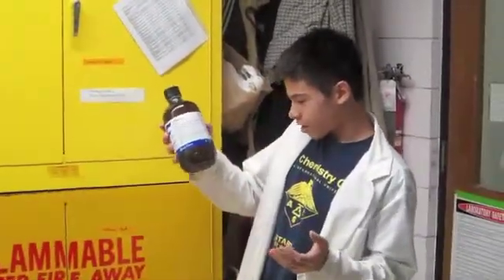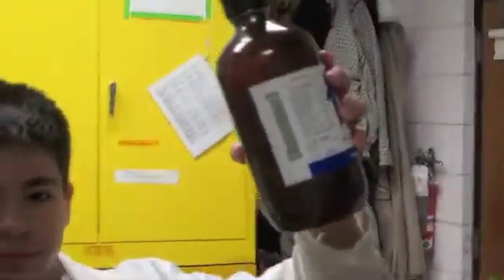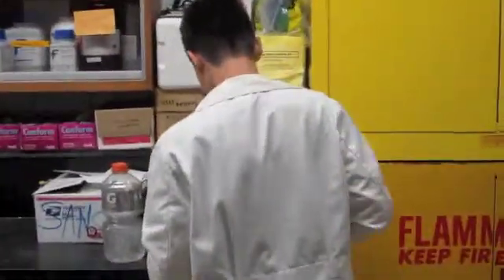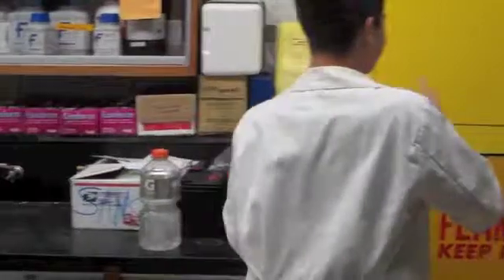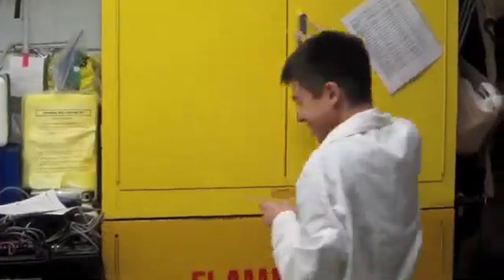But Martin, you want to tell the audience a little bit about the use of chloroform in this lab? The use that we have for it? The use of the chloroform in this lab is to inhale to get high and pass out from all the hard work that we've done. That's exactly right. Well, chloroform makes a very good solvent. So it's used to dissolve a lot of compounds that would usually be insoluble in water or alcohol.